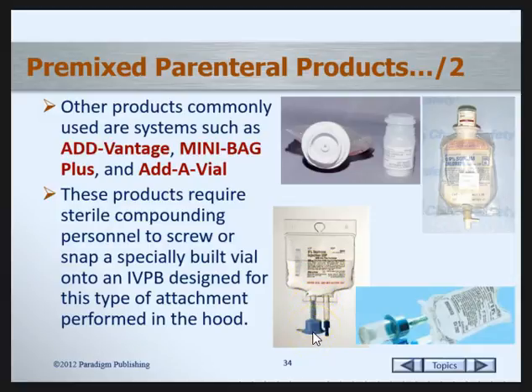She squeezes the bag, the liquid goes into the vial. She turns it upside down, squeezes the bag, and the pressure draws the diluted drug back into the IV bag, and then she attaches the tubing and is ready to hang the IV bag.